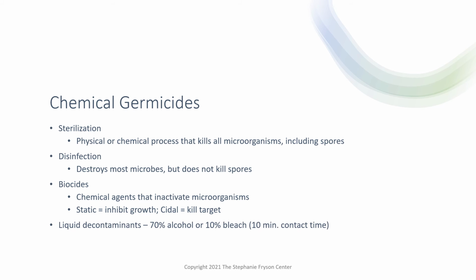Liquid decontaminants, 70% alcohol or 10% bleach. Those are decontaminants, and notice in parentheses there's a 10-minute contact time. That means you have to put the bleach on the counter, let it sit for 10 minutes before wiping it up.